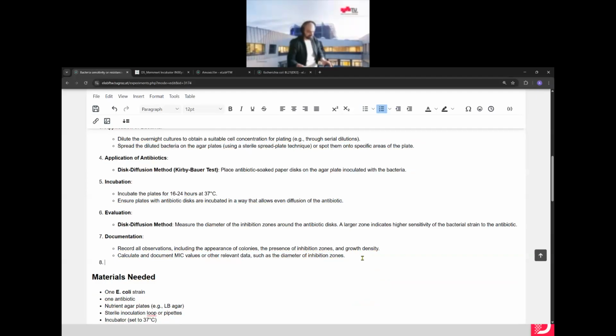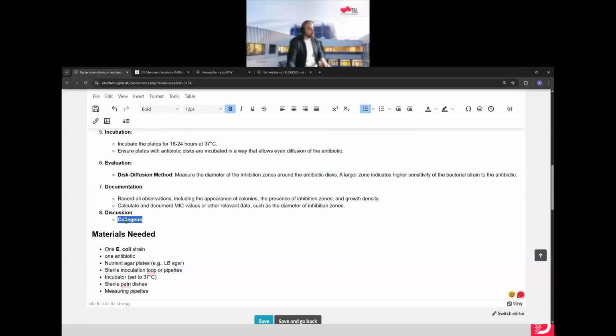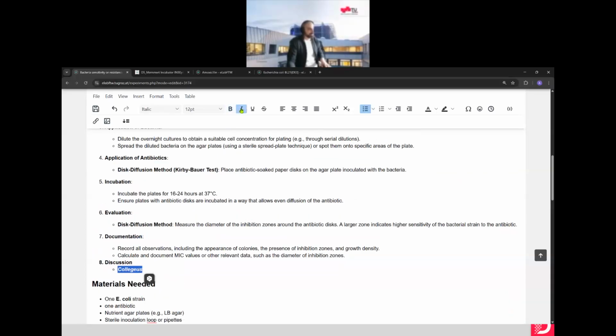I don't know what I want to do in an 8th step. Maybe a discussion with my colleagues. So I will just do this here as well. And I want this. And I don't want to highlight this here, something like that.